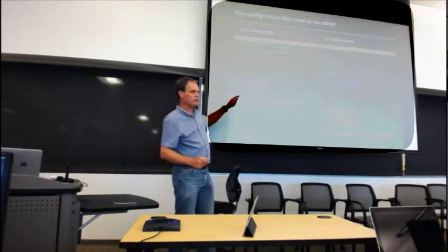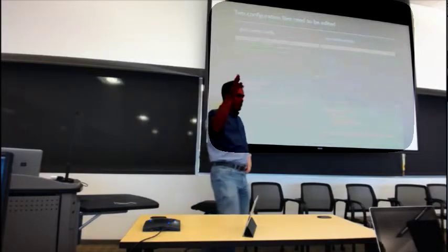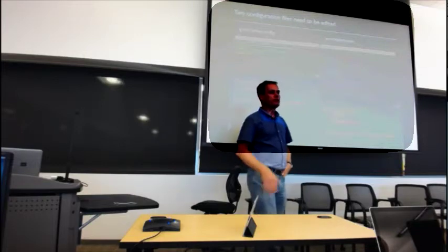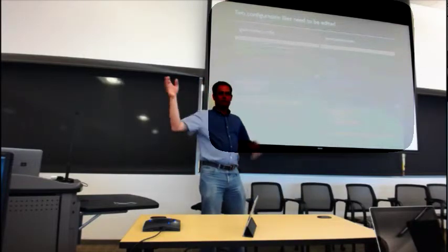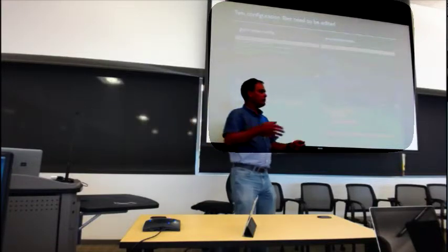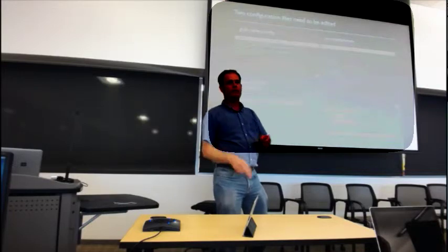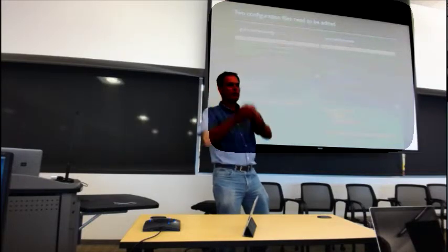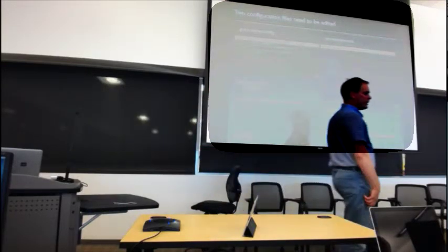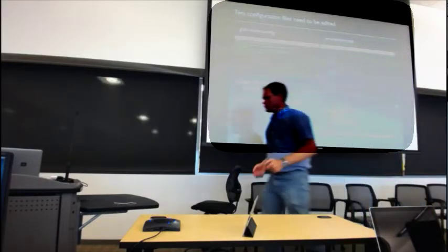Which HDF5 dirs should we use? The tarball. Yeah, that's where the tarball was expanded. It'll be the scratch directory for this experiment, which I won't recite because I'll go mad, times whatever you called your private directory, and then there's a Cheetah thingy in there. You need to insert what your private directory is in there. And of course, you could point it anywhere. You could do whatever.